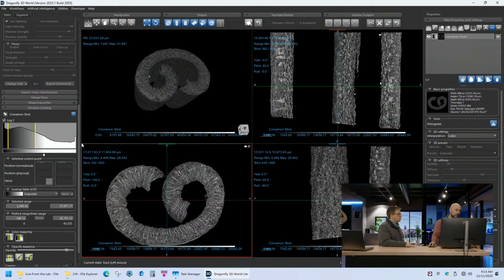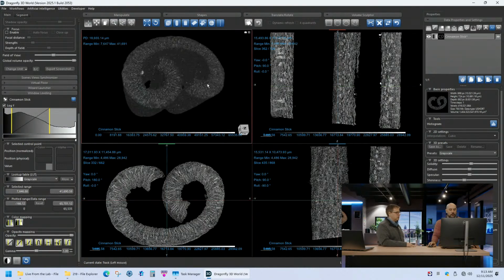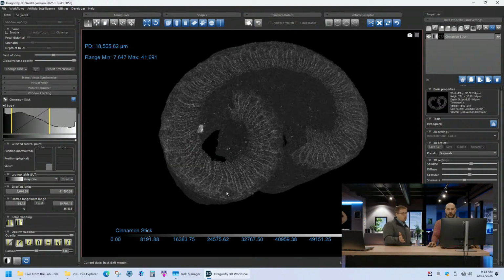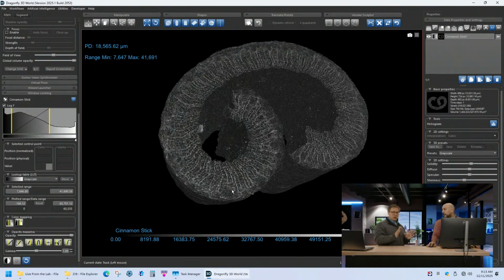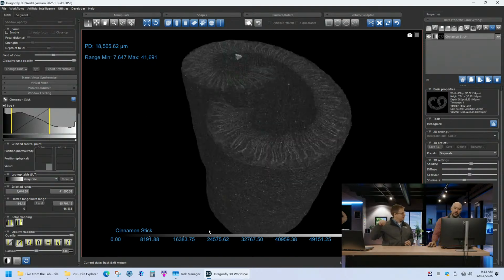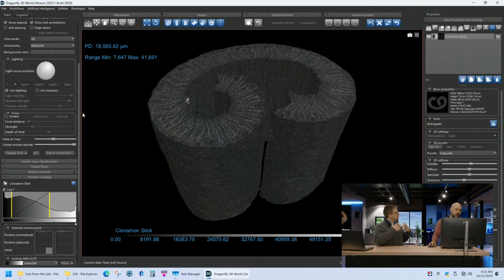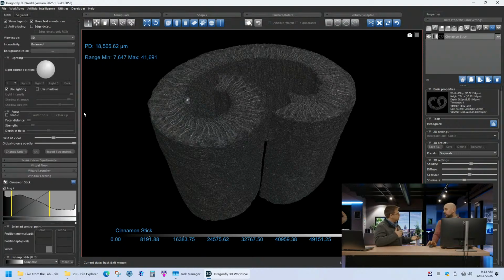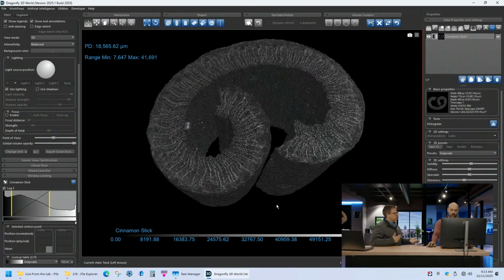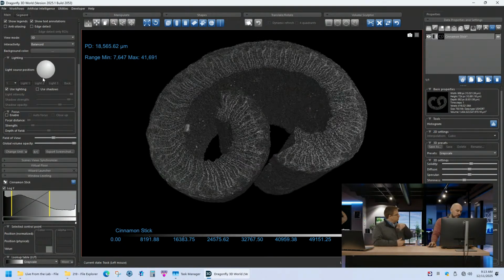So now you can actually change the color, right? Yeah. A real cinnamon stick is not gray. One thing to note about XRM, you don't see color. To be very clear to people out there, if you ever see pictures like the one that we had on the TV here, we have to add the color back. We see density, or actually it's absorption, the absorption of the different density materials, and that generally goes with density.